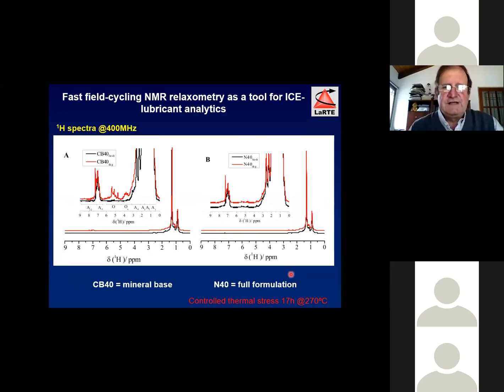And okay, you see here using spectroscopy, you can see quite well the effect of the thermal degradation. Again, this is for both, we use 17 hours at 270 Celsius. Clearly, you can see here the effects. These are mainly oxidations. And not in the lubricant, so the additive pack is very effective here in preventing the oxidation of molecules. You see, this is the lubricant with the pack, and this is the base.